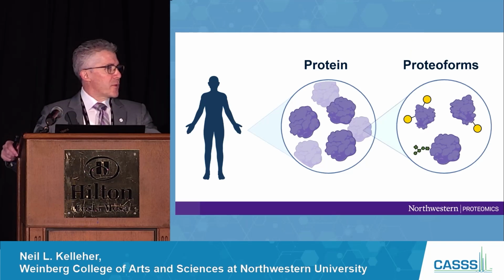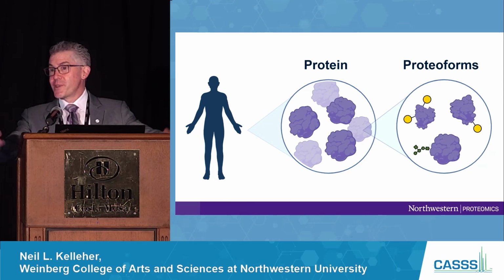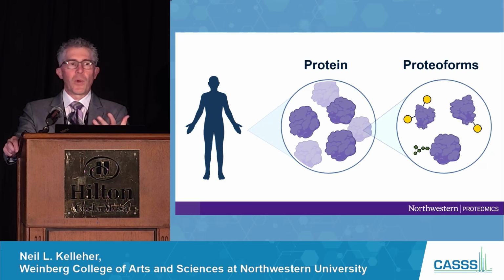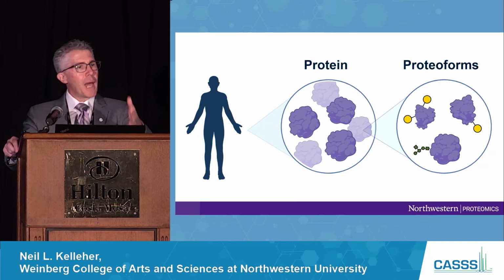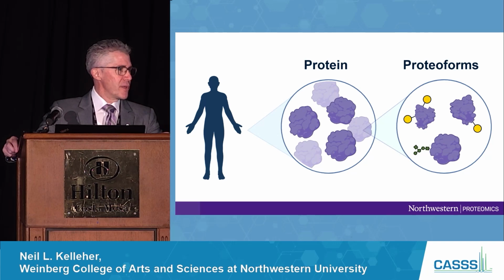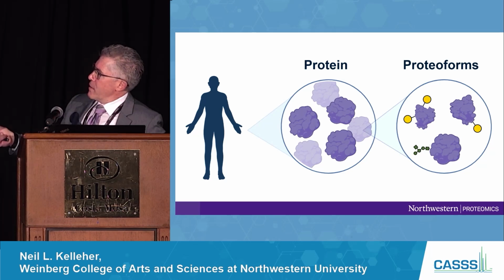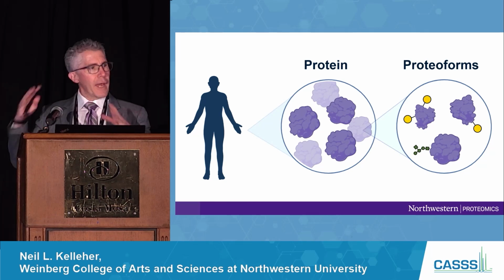So I'm going to give you a small dose about the promise of proteoforms and just the reality. This is really pretty simple, that the concept of a protein is not specific enough to capture our biology. It's not specific enough to capture the protein-based drugs that you're making and modifying with ADCs. Of course, you need to know the distribution of drugs and the DAR on those antibodies, right? It's the same concept, just brought to endogenous proteins that are created from the 20,300 human genes. Concept of a protein, it's not specific enough to capture our biology. So why should we think that drug development is going to be efficient? Why should we think that companion DX and biomarkers are going to be on point for proteins? We have to get molecular characterization with complete molecular specificity to make those be more efficient at enterprise scale.